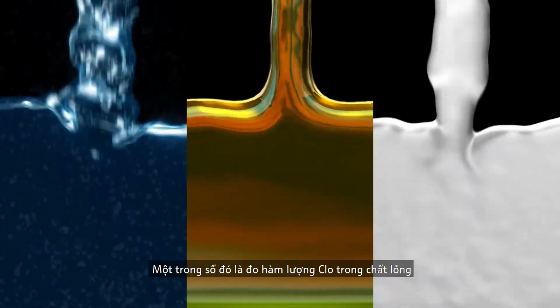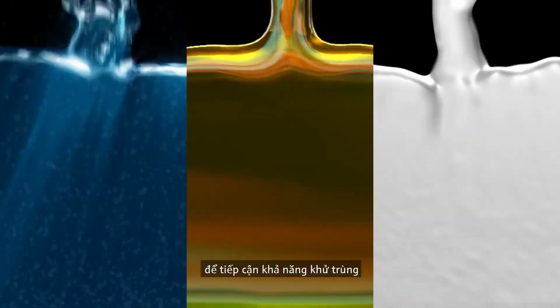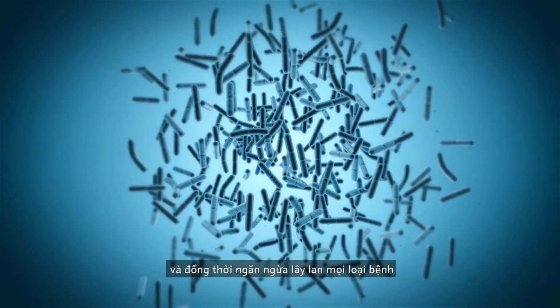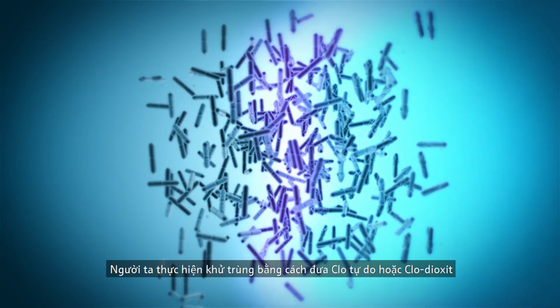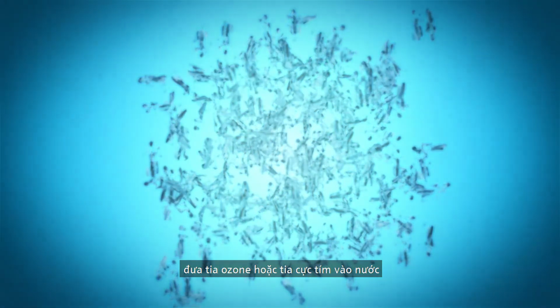One of these principles is the measurement of the chlorine content in liquids to assess the disinfection capacity. Disinfection destroys pathogens such as bacteria or fungi and prevents the spread of diseases. It is accomplished by applying either free chlorine or chlorine dioxide, ozone, or ultraviolet radiation to the water.